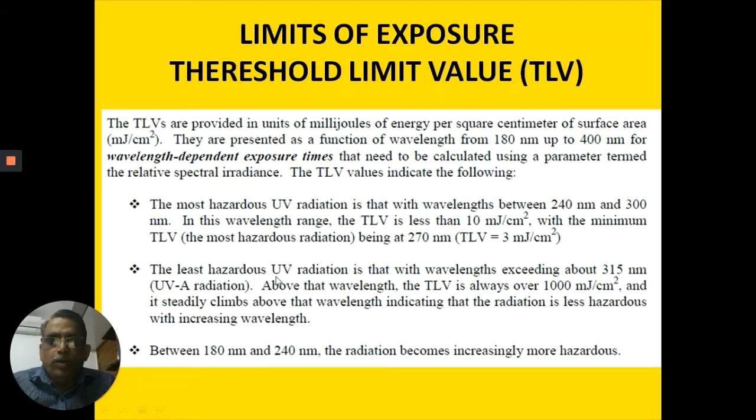Now, for the least hazardous, longer wavelength, you can have up to 1000 millijoule per square centimeter. So that is the TLV limit. For shorter wavelengths, something like 10 millijoule. For a longer wavelength, 1000 millijoule. But at 180, it is zero. It is really hazardous, so you should not be exposed to this region at all.